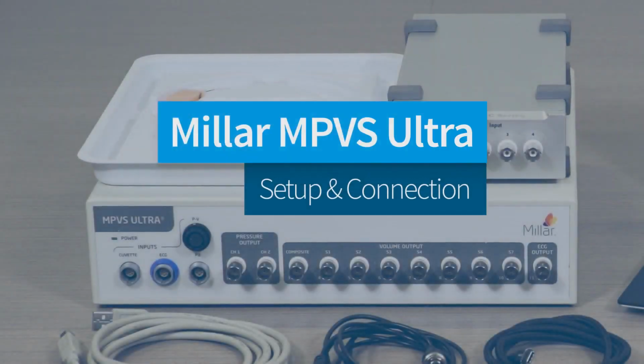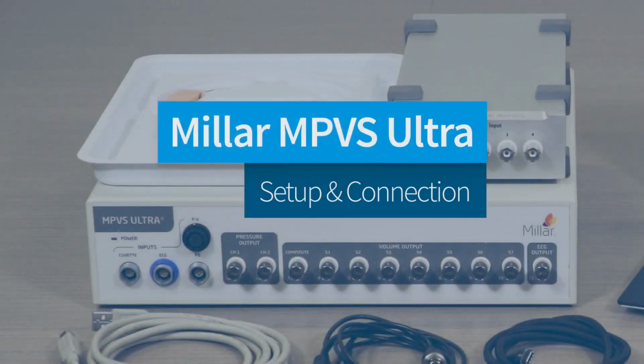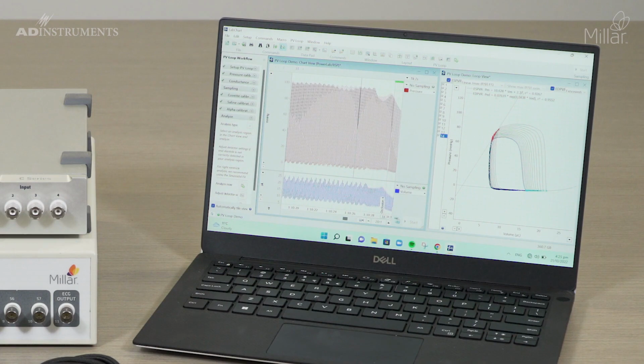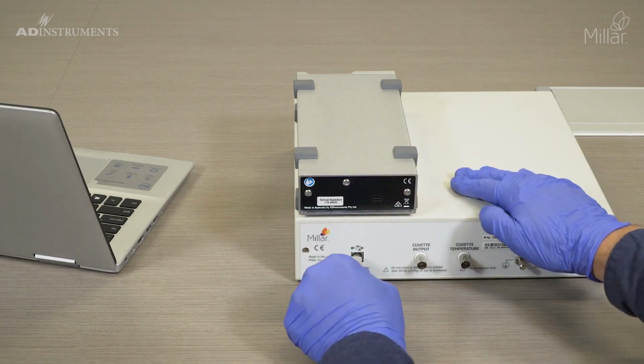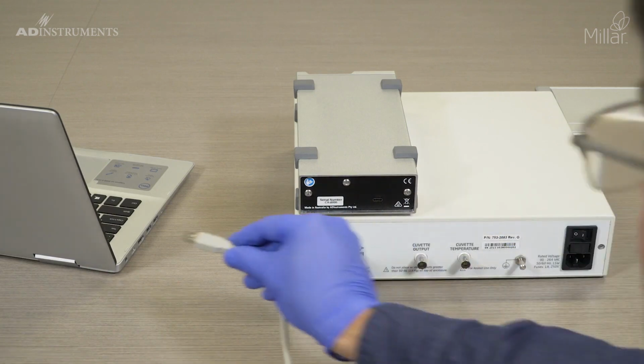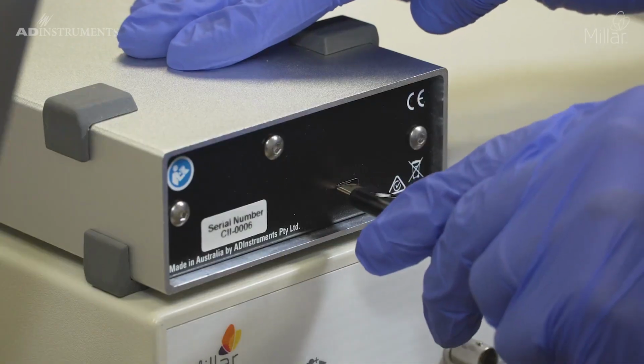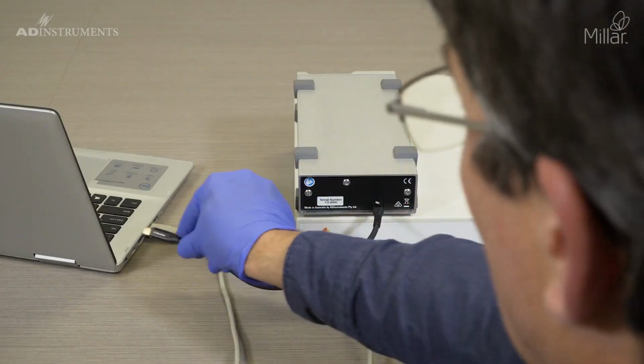This video will demonstrate how to connect and set up the MPVS Ultra and C-Series PowerLab for small animal PV. Make sure you have installed LabChart and the PV Loop module, as well as the MPVS Ultra control software. Connect the MPVS Ultra to the same PC using the supplied USB cable. Connect the instrument interface to the PC using the provided interface cable.